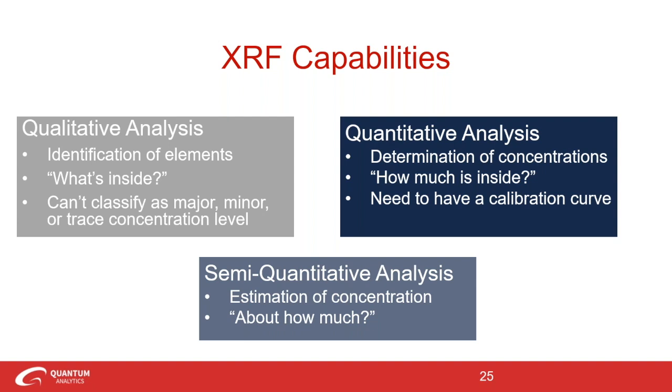So when you analyze your sample by XRF and you get qualitative information saying, aha, it is this element, or these elements are present, they're usually pretty good, but again, look at it with a cautious eye, just to make sure that does make sense.